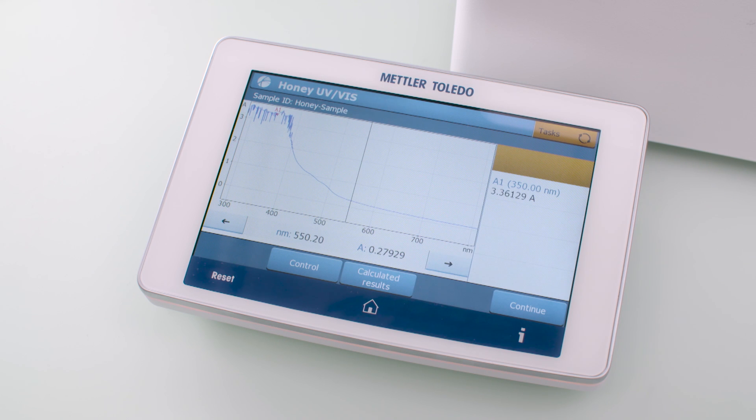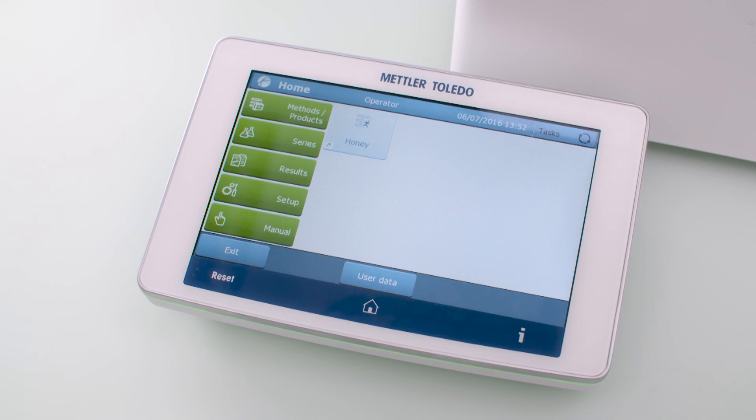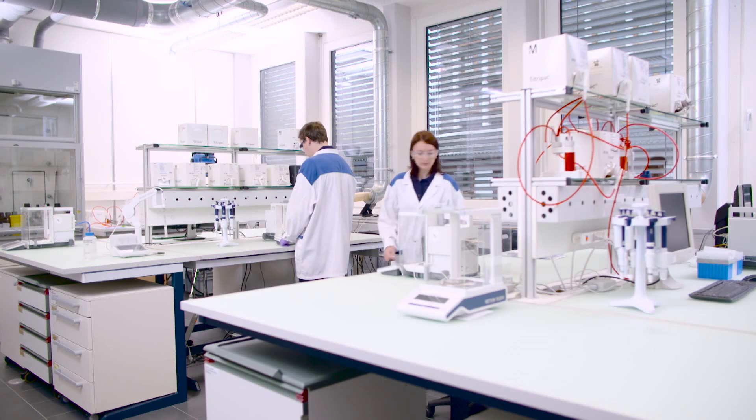The measurement result is automatically stored in the database of LabX, which can be accessed from anywhere with different user logins.